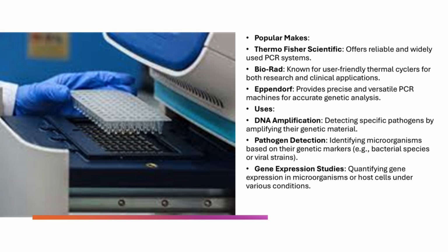Now, let's explore the key uses of PCR machines in microbiology labs. DNA amplification. PCR machines are most commonly used for DNA amplification. By amplifying the genetic material of specific microorganisms, researchers can detect and identify pathogens even in low concentrations.